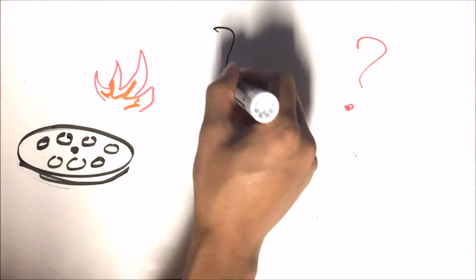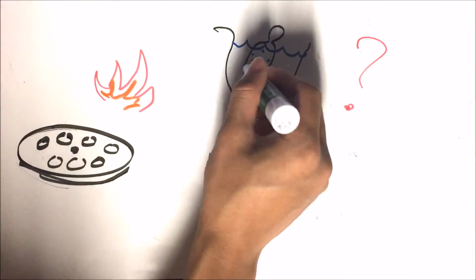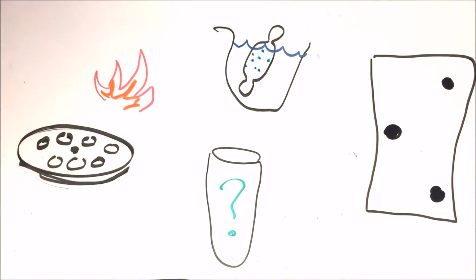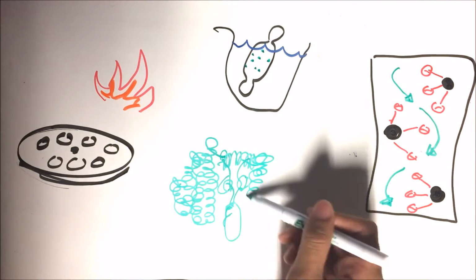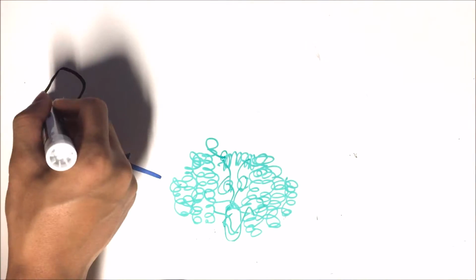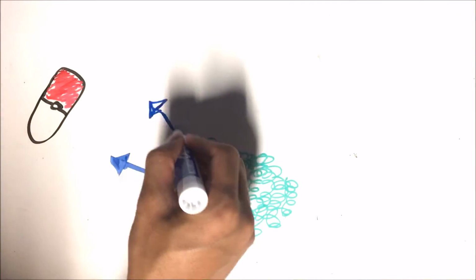Based on the knowledge about different proteins and their properties, and with a little help from technology, scientists and researchers have developed methods to separate target proteins from complex mixtures. This is known as protein purification. Protein purification is a fundamental concept for aspiring biochemists.